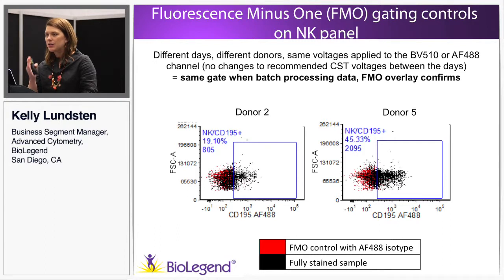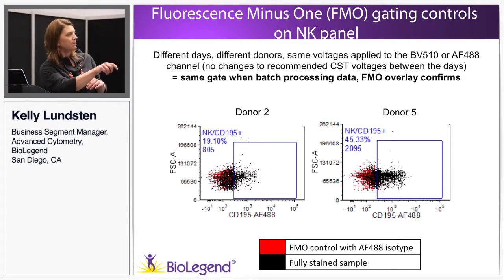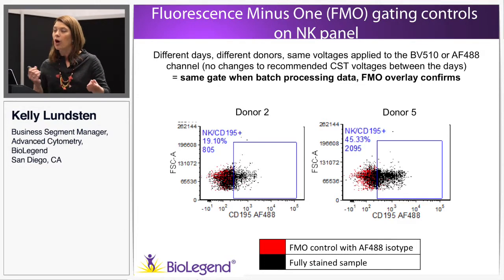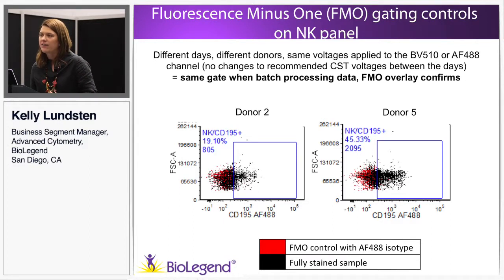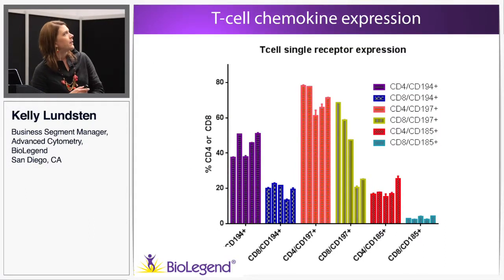Sometimes, especially with dendritic cells or monocytes or macrophage, I'll use an isotype control in lieu of negating the antibody, in the event that there's any background coming from nonspecific binding due to any sort of ingestion or nonspecific binding due to the fluor or the Fc receptor. So in this case, just for giggles, I put in an Alexa Fluor 488 isotype, which is often a broader FMO, and this is significantly more accurate than just doing it by eye. My mantra regarding FMOs is always, this is not art class, this is science. If you can't produce the controls by which you derive the statistics, you should never be presenting them, let alone publishing them.